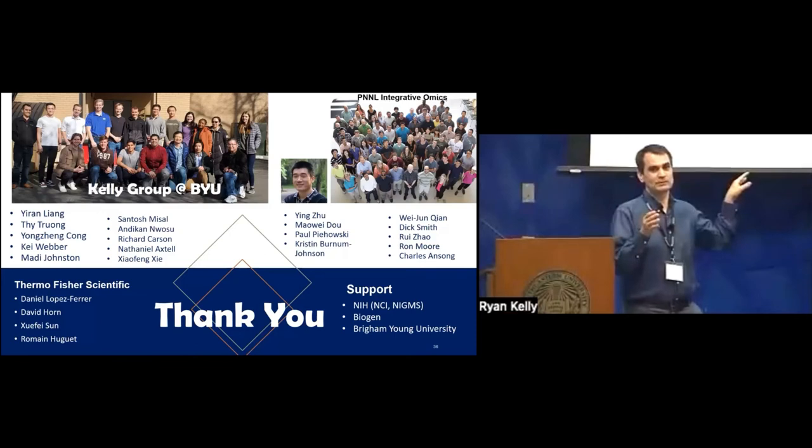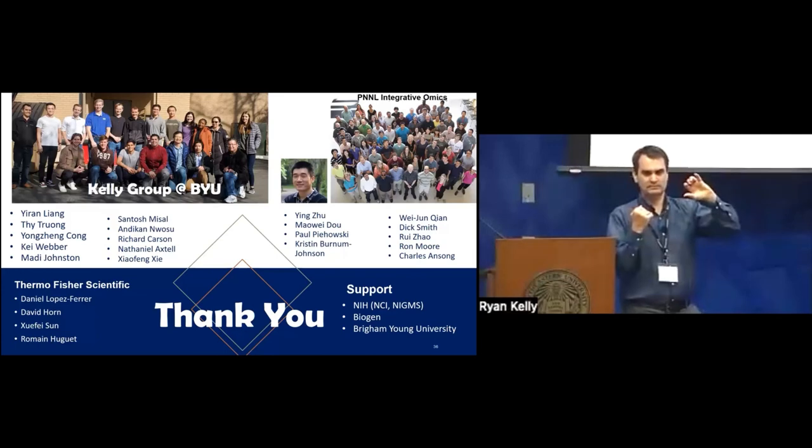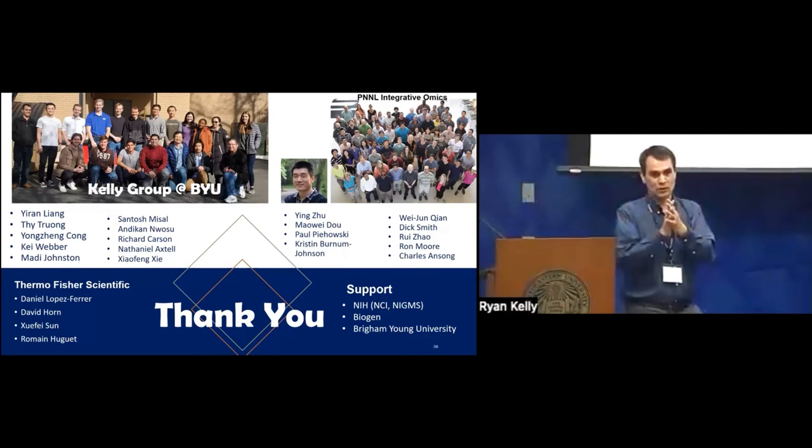For us, we were just like, well, let's just be super strict and then hope for the best, you know? So we don't have an FDR associated with those, but it should be pretty reasonable. And then the last thing is you can search against a mixed proteome, right?